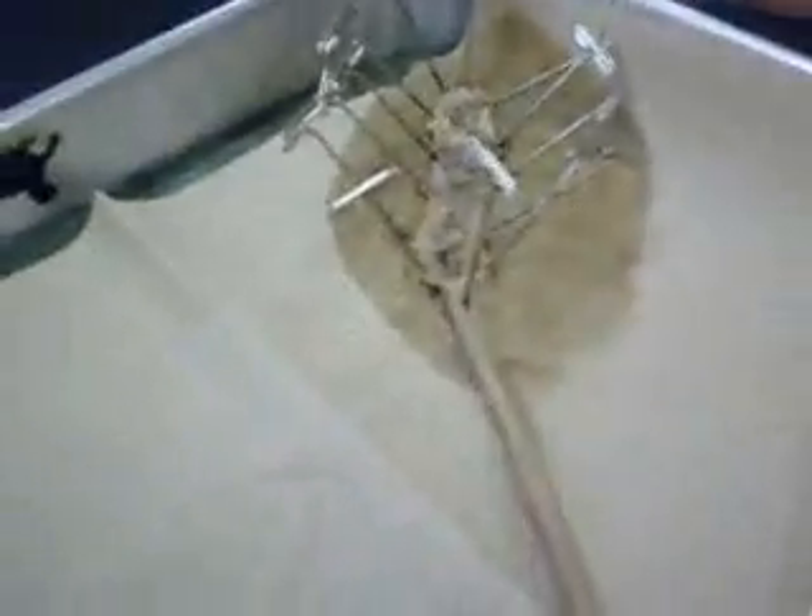Did you know that worms have both female and male parts? They have testicles and ovaries. They're down here somewhere.